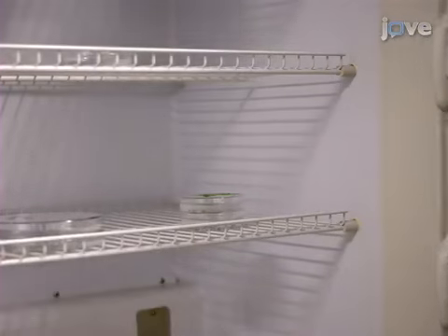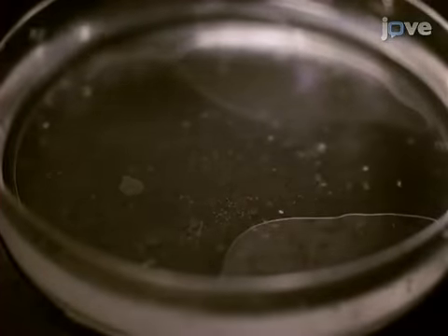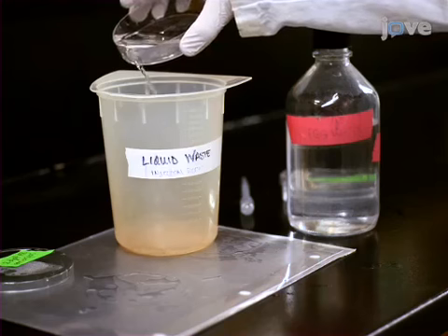Grow the embryos in deep petri dishes at 28 degrees Celsius in egg water until the desired developmental stage. Remove any dead embryos daily. Carefully decant the old egg water and replenish with new egg water daily.